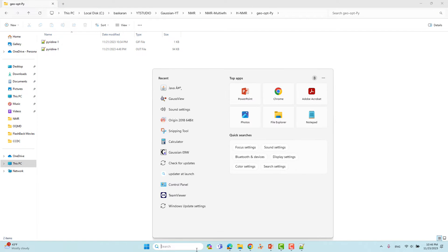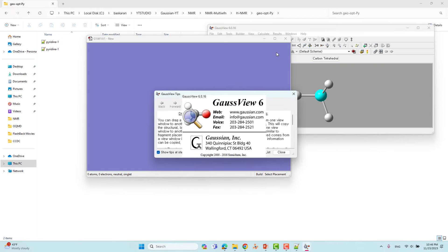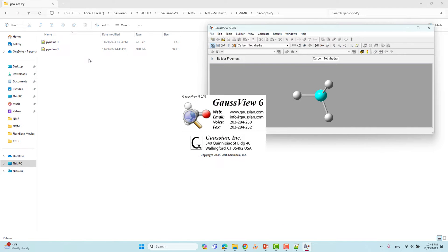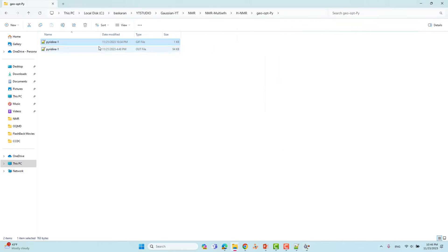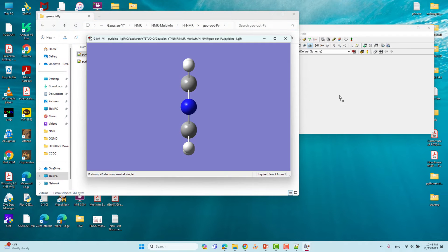I will open the GaussView software. This is GaussView — I will open that .gjf file. If you don't know how to prepare that input file, you can watch my earlier Gaussian videos where I clearly explained how to make an input file.